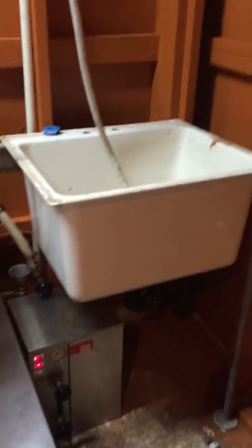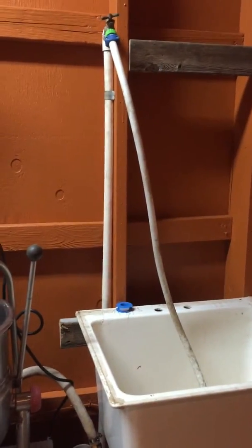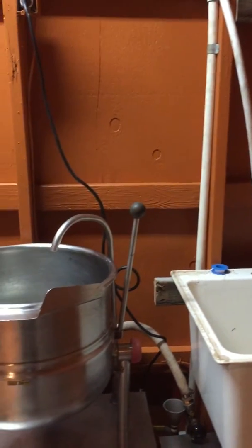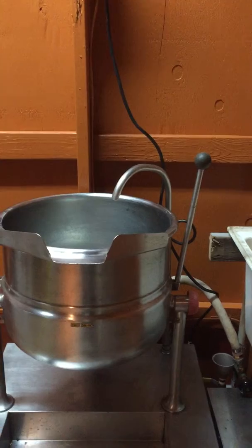We flushed it out really good. We've got our sink here. We put a hose up here so we can kind of move it around. We have water hooked up to that but I need another fitting to get it going, so I got it capped off right now.